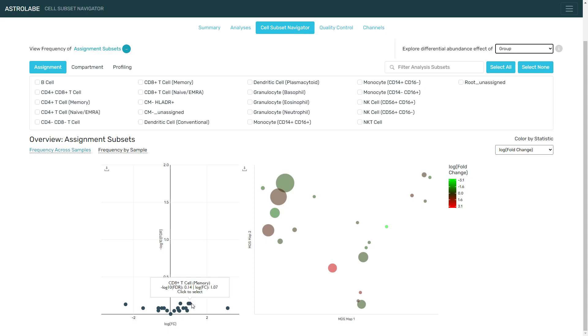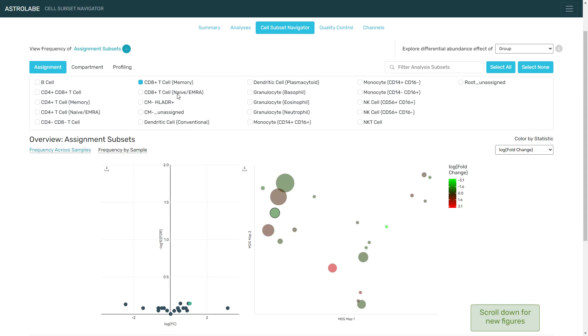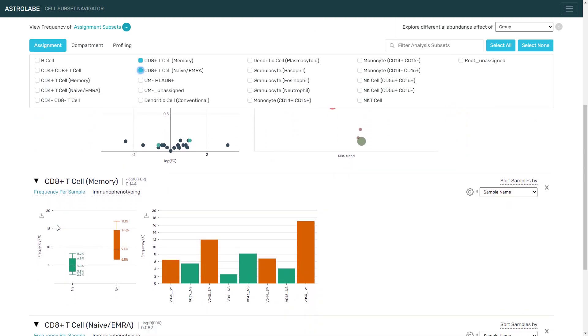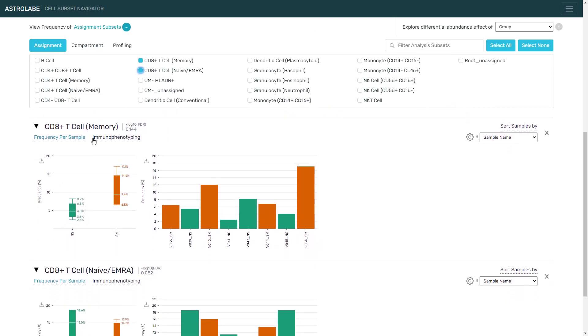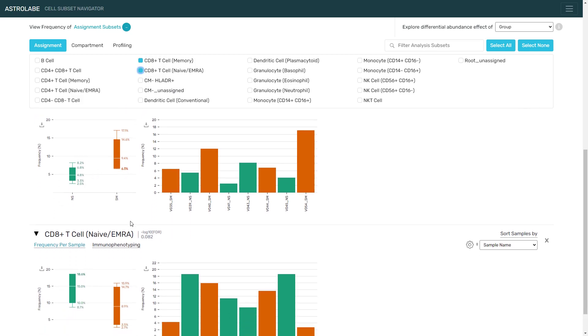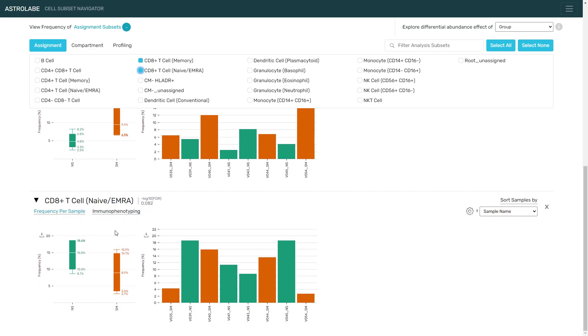For example, it appears that the fold change increases for the memory CD8 T cells. I'm going to click on it, and then I'm going to use the dashboard up here to choose the naive or EMRA CD8 T cells. Scrolling down, we can see how the frequency of the memory CD8 T cells increases in the smoker population compared to the non-smokers. This seems to be a two-fold change, and the frequency of the naive cells seems to decrease by a similar fold change.